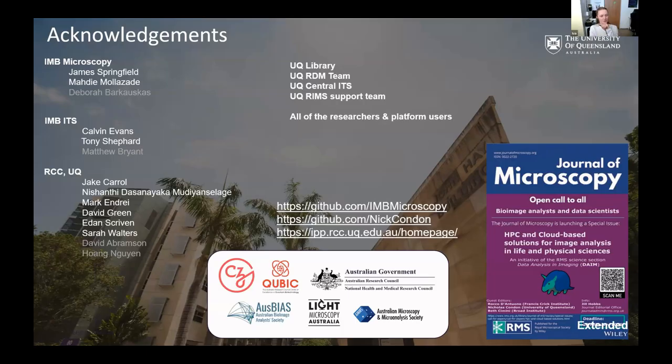Do you see a lot of people using the Remind tool that you created? I would say our casual users who just come in and want a picture, not so much, but the heavy imaging groups are certainly using it because they can see the benefit. They're on the systems every day and are generating a lot of files. So having that information has been useful.